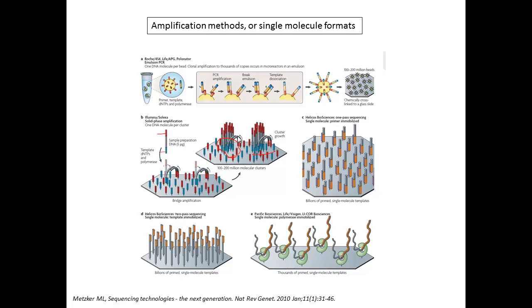And so what we have is what's sometimes called a colony of PCR products. Colony because that's what appears on a plate, but these are PCR products, so they're sometimes referred to as polonies. Now we've amplified a single molecule into perhaps millions of copies of that same one in a location, and we're going to eventually sequence this using fluorescence imaging.